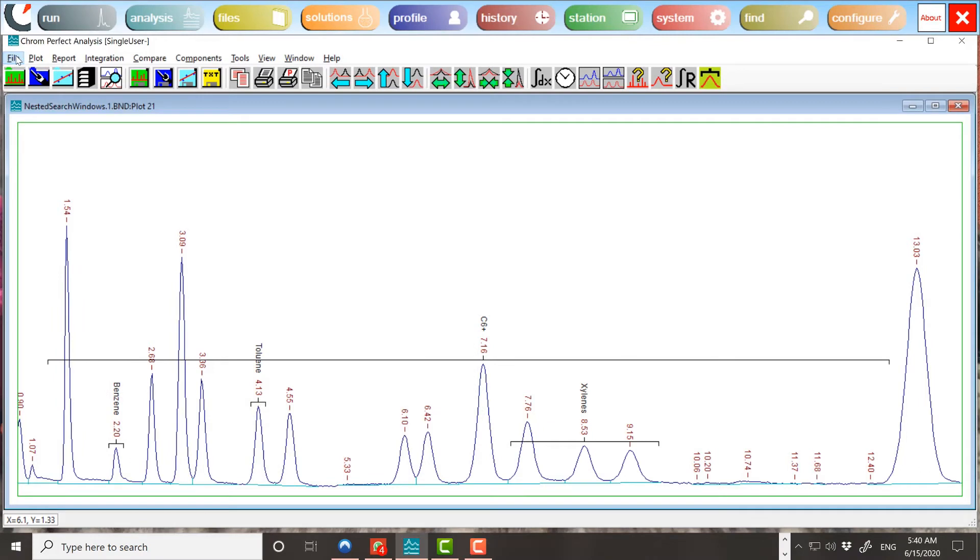Complications arise when search windows overlap. If two windows overlap, and a peak lies under both windows, then that peak will contribute to both components' window response and window amount. Therefore, the total of the window responses may be more than the total response of all peaks.